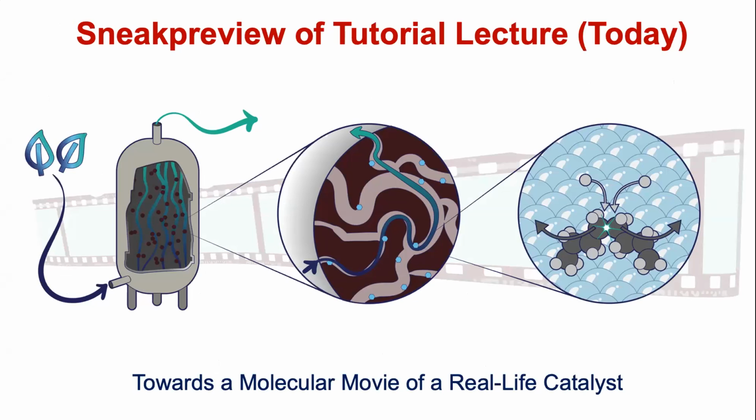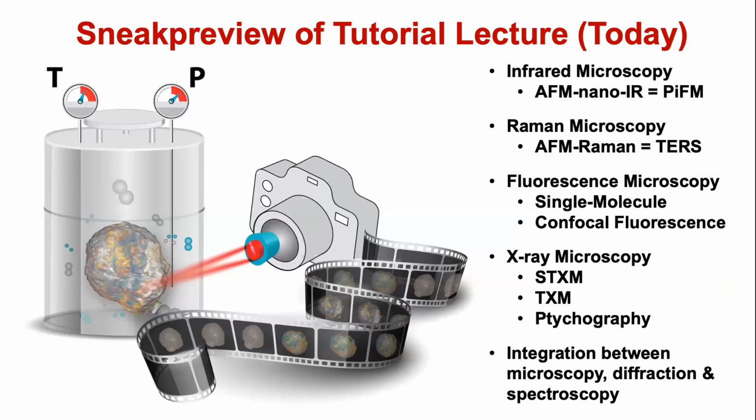As for today, I would like to give you a sneak preview. At the end of my presentation, which will be the second half of the lecture, after a break in between, I want to talk about what it would take to make a movie of a catalyst particle. By doing this, I will introduce you to a lot of methodologies which allow you to do this. So today I will talk about X-ray microscopy, single molecule fluorescence microscopy, electron microscopy, combinations of techniques, and so on.